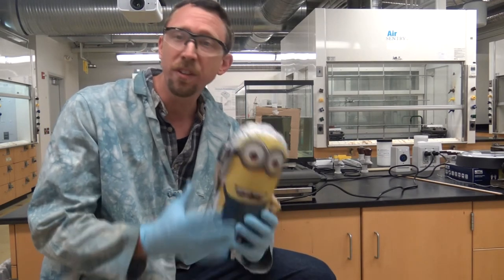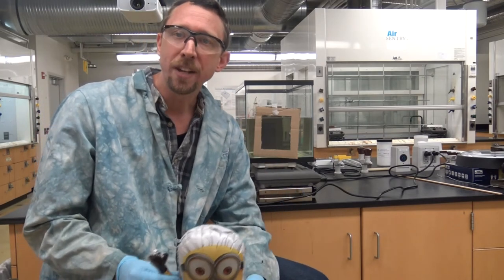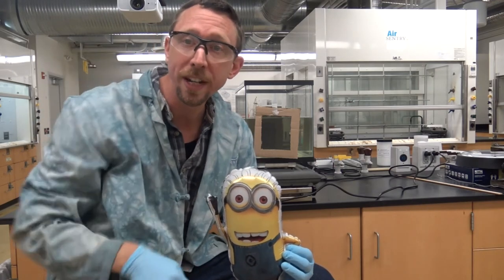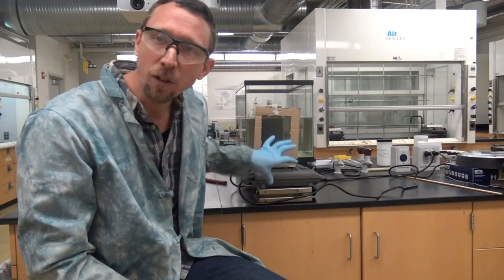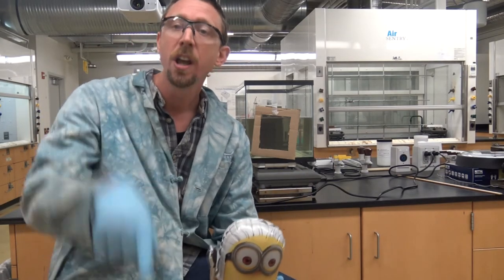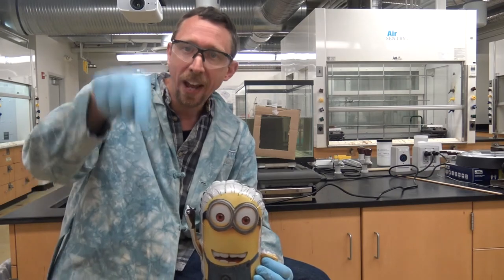Let's recap what just happened. We essentially built a very simple polarimeter. In our polarimeter we had a light source which was the reflected light from my assistant Dave. We had a polarizer and that polarizer made sure that all the light that made it from Dave to our eyes was plane polarized, oscillating in just one orientation. Now when we had an achiral material inside of this tank, water, we observed that a second polarizer had to be aligned parallel with the initial polarizer in order for that light to get through and to our eyes.